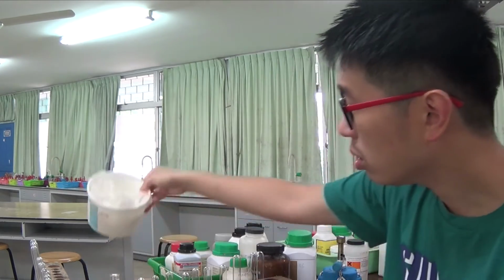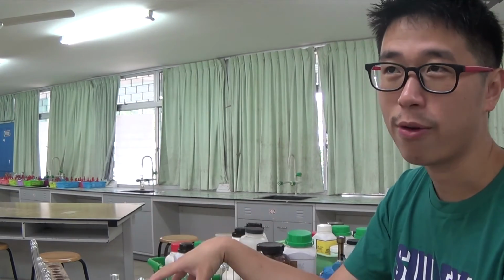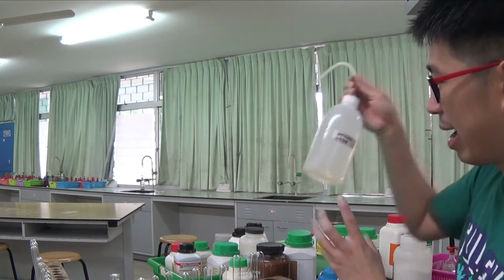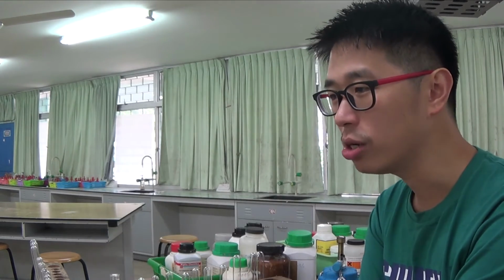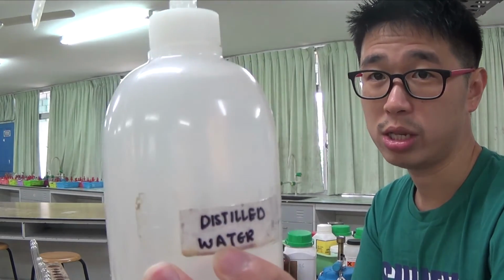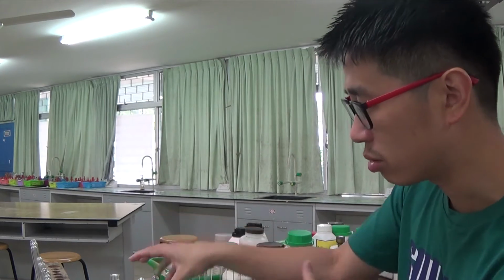So in order to test for cations and anions, usually I would dissolve the substance in solution. This was what I just heated, and even though I drove off the water, when I make up the solution, I will add distilled or deionized water. We never ever use tap water to dissolve our solution for qualitative analysis, because tap water contains dissolved ions, and distilled water, which is also called deionized water, does not contain any dissolved ions at all. So I do not want to be adding cold water straight to the hot test tube.